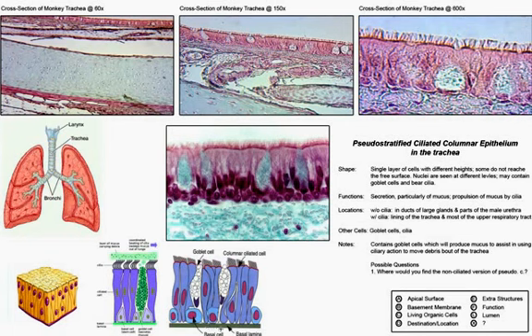And then beneath that we have areolar connective tissue, also seen here, and that band of tissue is seen easily here as the double part structure that's going to be identified as the lamina propria. This is mostly identified primarily in the mucous membranes that line our body's moist surfaces or entryways. Down below the area where we have the submucosa, so that's the mucosal lining. Here's the submucosal area that has a great amount of arteries, veins, and lymphatic ducts of glands.